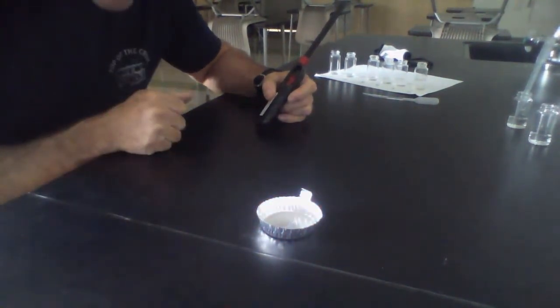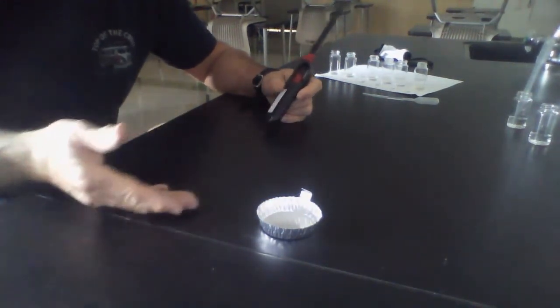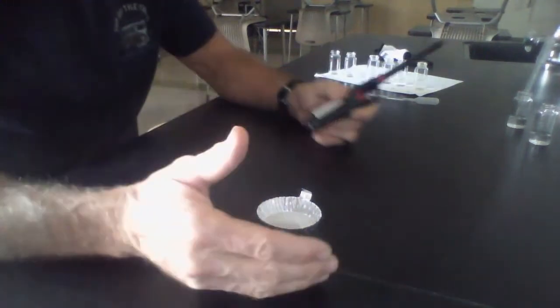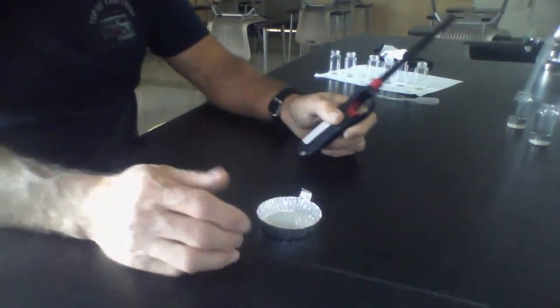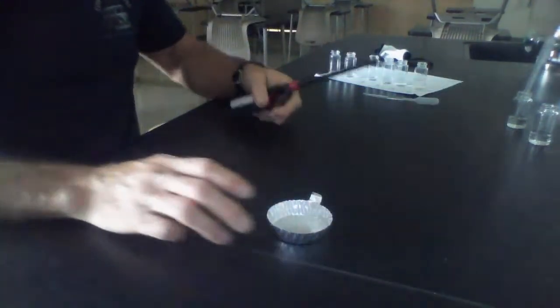It's burning slower. It didn't move around as much. It acted almost like it was thicker. It was just less likely to bounce around or move around. Oh, and it's done. I hope I said when it was done. Maybe you could have observed when the color went off.